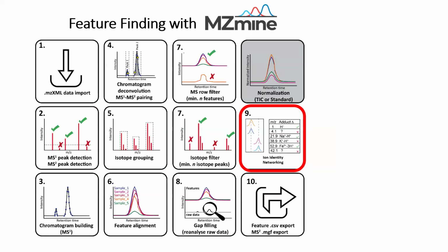Okay, now to understand what we're going to watch in a minute on Cytoscape, it's important to stress this thing that Stefan already explained very well in the previous talk. Basically, we started from raw data, and we built chromatograms, and we did a lot of filtering steps and isotope grouping in order to reduce the complexity of our data, because as you saw, we have very complex data.